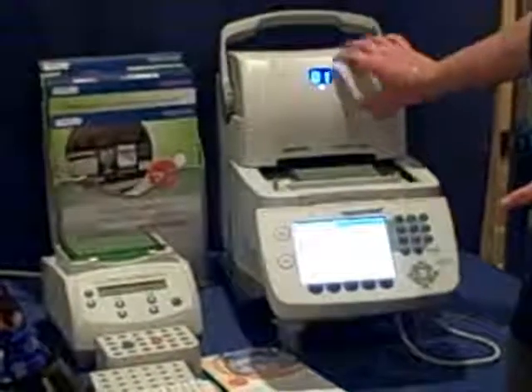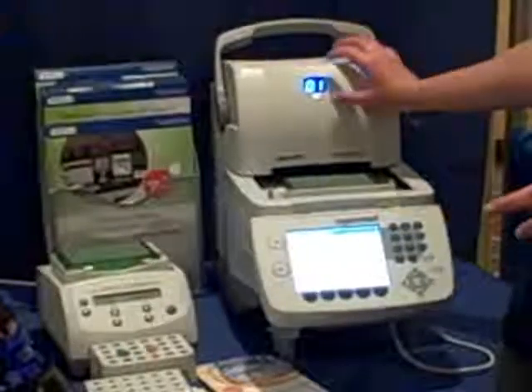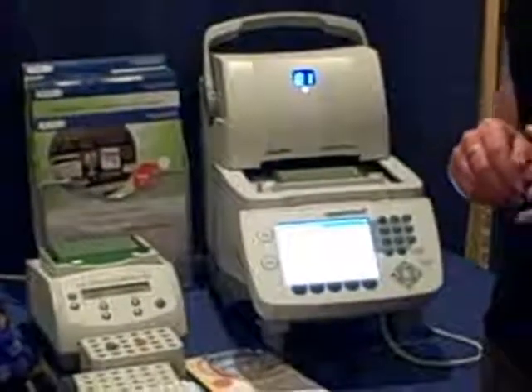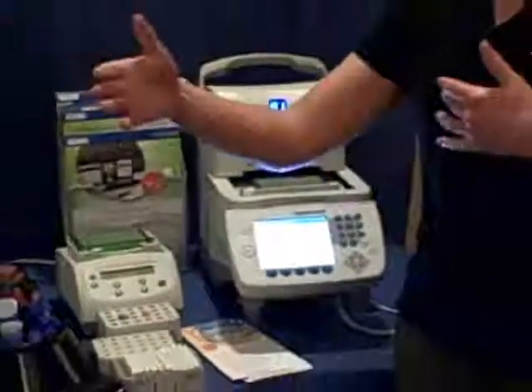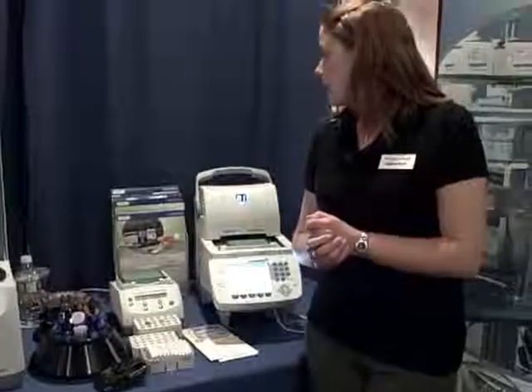It's also got a nice digital display, so if you have multiple units, you know which one's which — it would say one, two, three, four, etc. We also have software available that you can program 30 cyclers and run it off that.